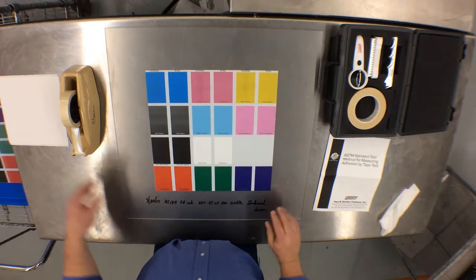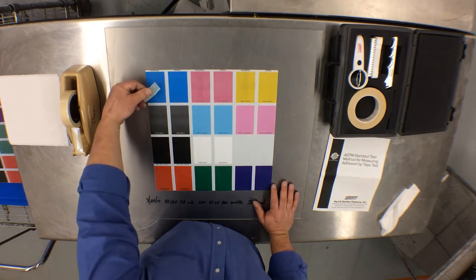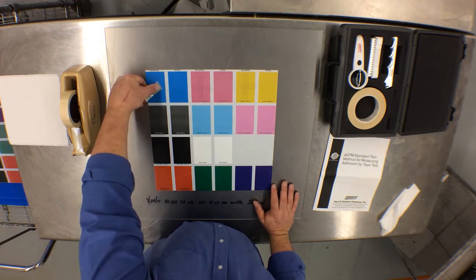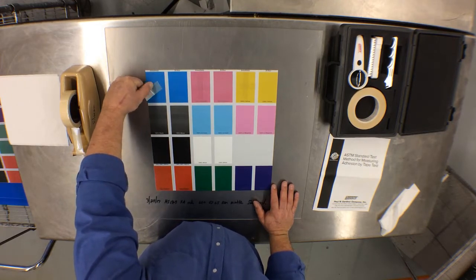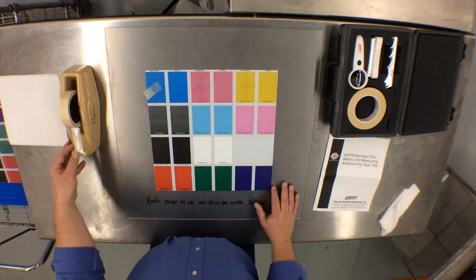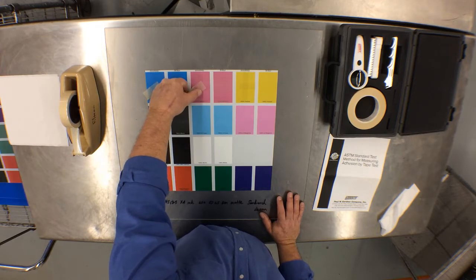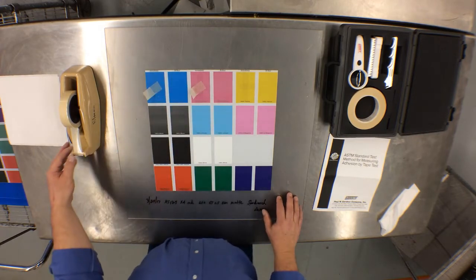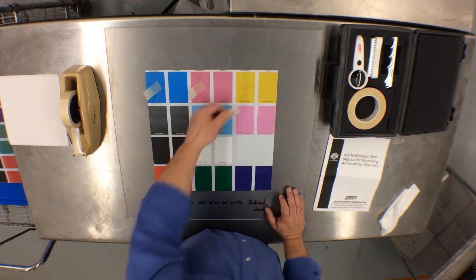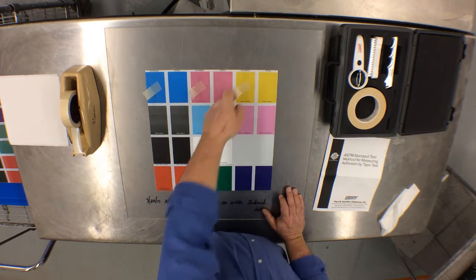Next, we are going to use a piece of the EndoTape on each one of the crosshatch cuts, placed at a 45-degree angle. The reason we place the tape at a 45-degree angle is to pull on the crosshatch-created squares at their weakest point, which is the corners. It is also recommended to allow the EndoTape to sit for 30 seconds prior to pulling for the tape test.